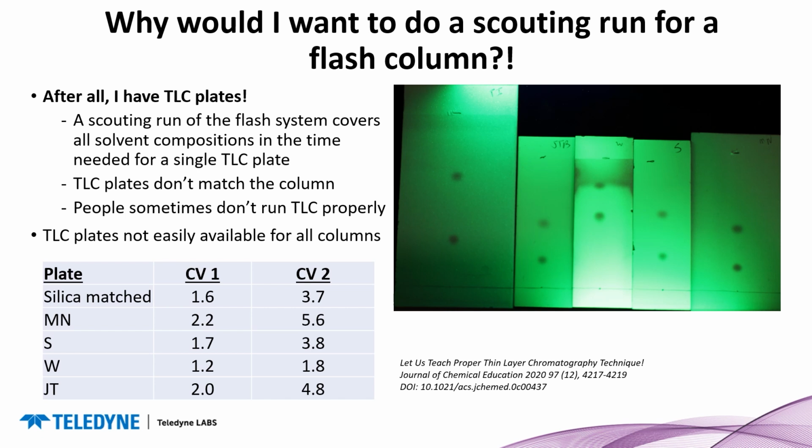The retention time of a column in column volumes is equal to 1 over the retention factor on a TLC plate. The matched silica plates gave results that matched the column retention, but the others, particularly brand W, gave predicted retention that failed to match the elution time. Scouting runs allow sample to be run on the same silica gel column as the purification.